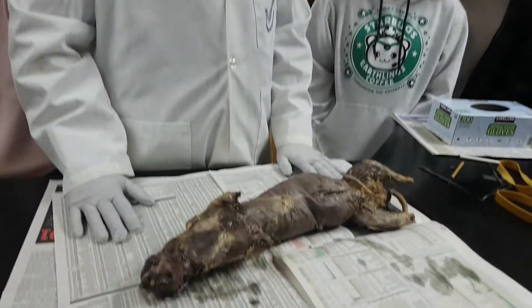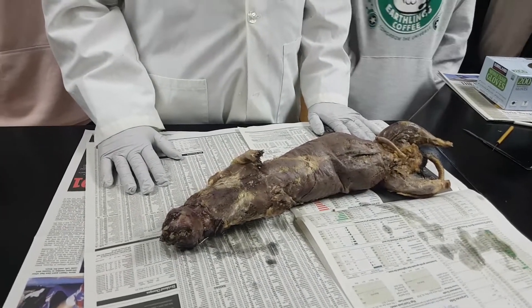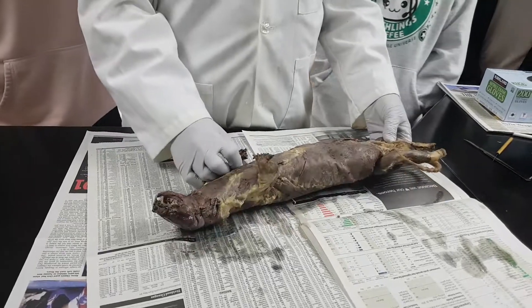They actually raise minks and skin them for mink stoles, jackets, coats, and stuff, so they're available. And yes, this is a male — you're very observant.